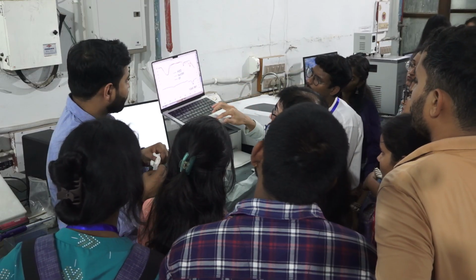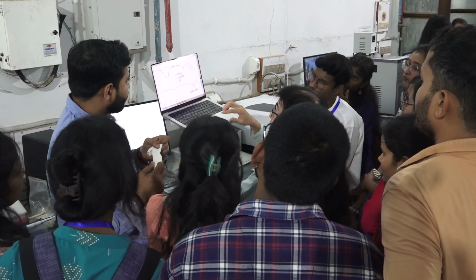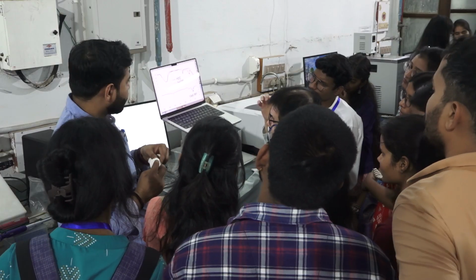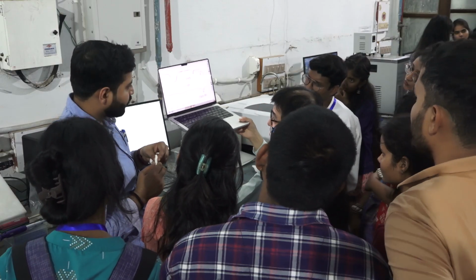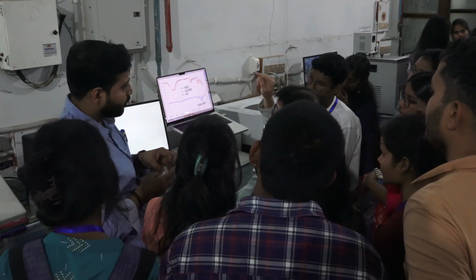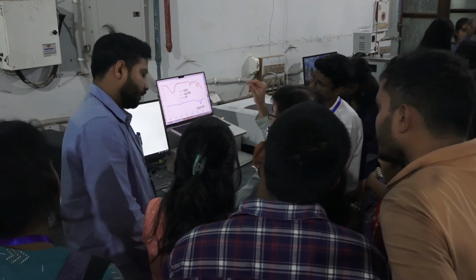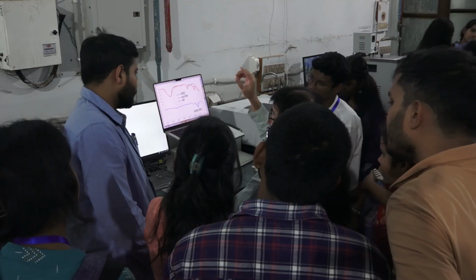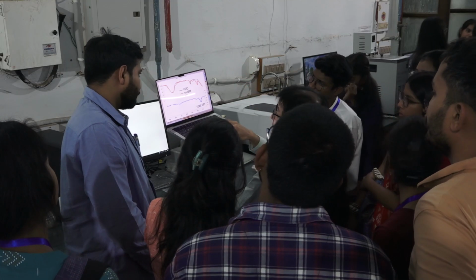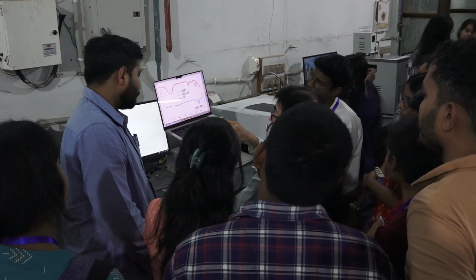And 1450, this is CH wagging. Probably you can imagine the sugar structure. It consists of a 6-membered ring or 5-membered ring of C, C, C, C, O, so it has CC bonds, CO bonds, and CH bonds. The peaks assignable to these positions are seen here.